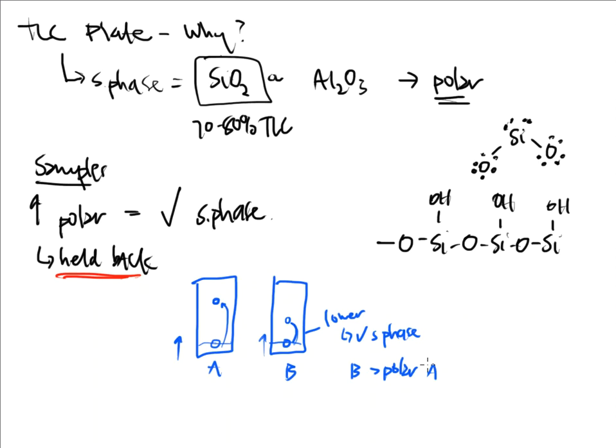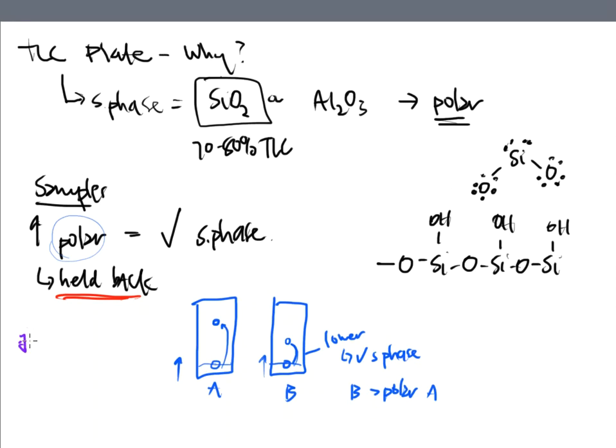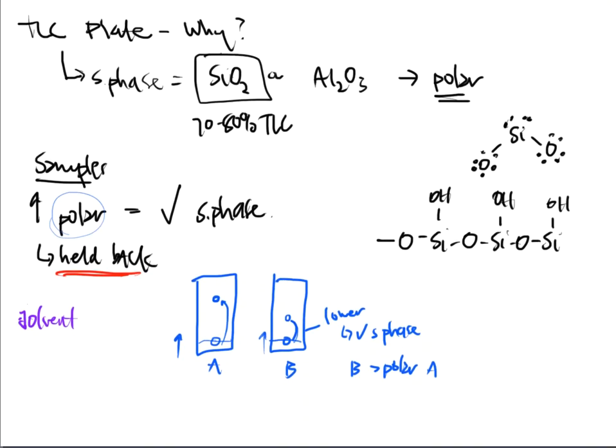Now, this is not the only thing that we talk about. Just like in the previous video, we said that polarity was the number one player here. But there are other players at stake too, and this is basically our solvent system. What kind of solvent are we using?